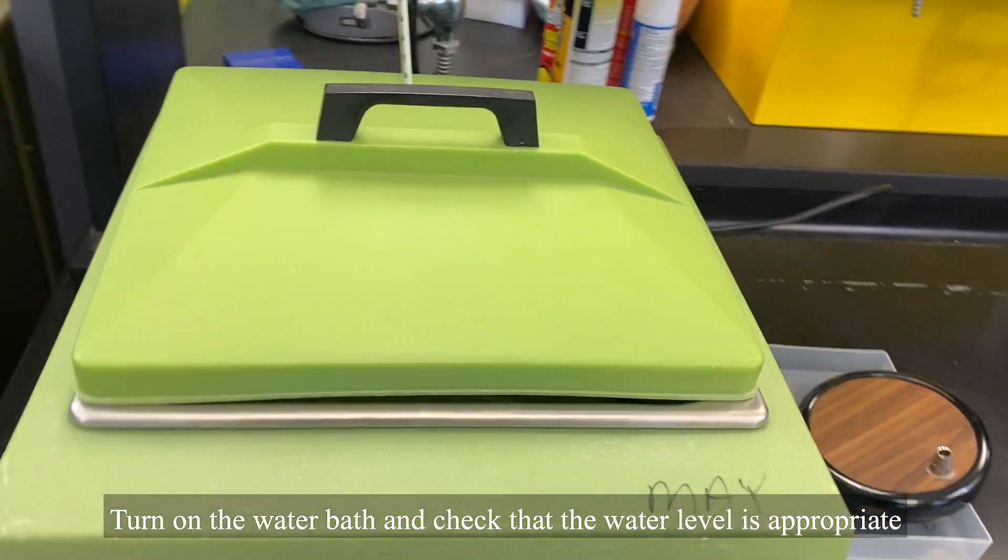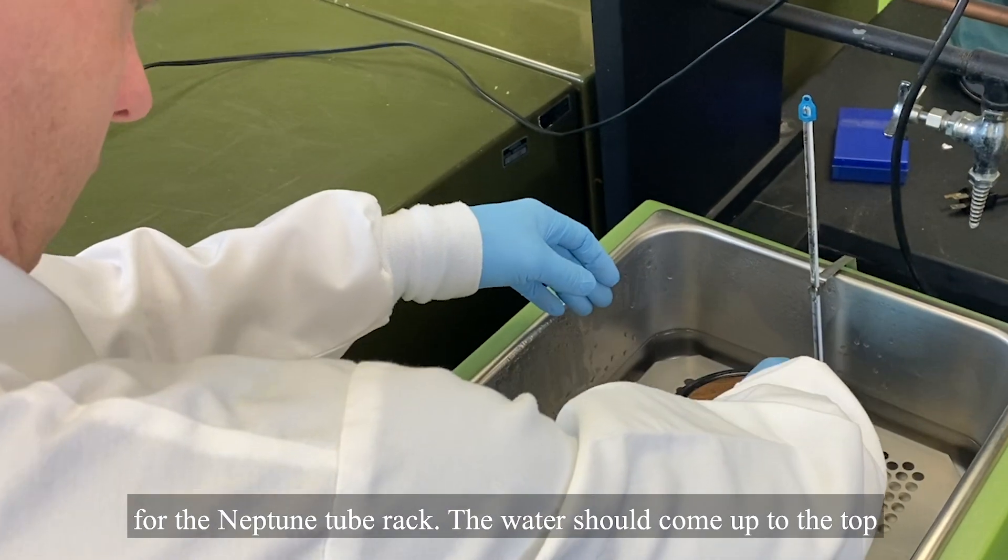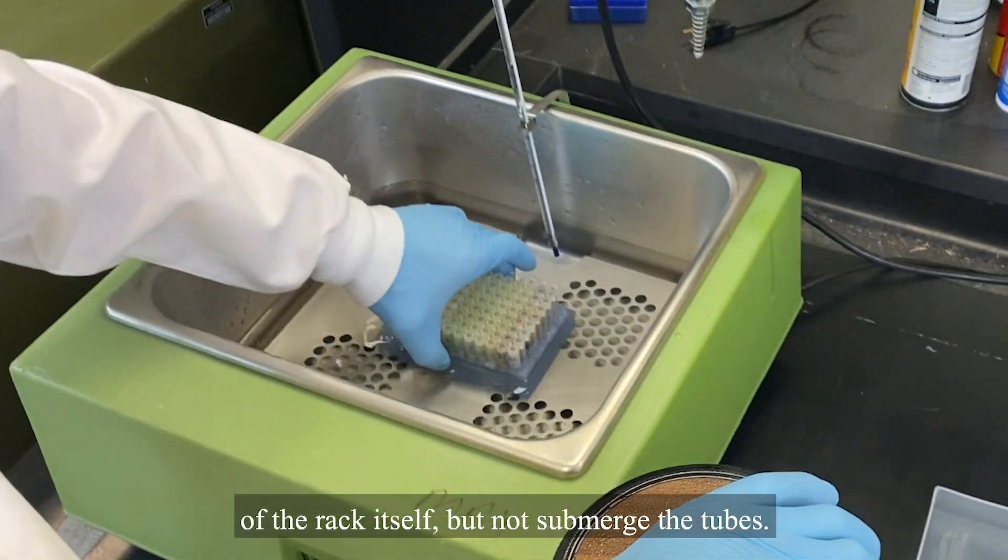Turn on the water bath and check that the water level is appropriate for the Neptune tube rack. The water should come up to the top of the rack itself, but not submerge the tubes.